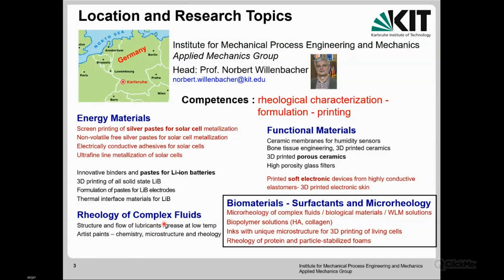But the topic we are talking about today, and I've been working on it for many years now, includes biomaterials, also surfactant solutions, or biopolymers like hyaluronic acid, collagen. Also, we are dealing with bioinks, and we are 3D printing these things. This is for printing with living cells.